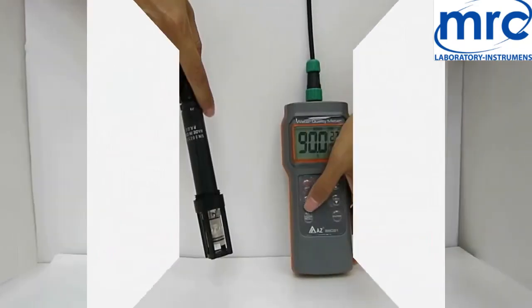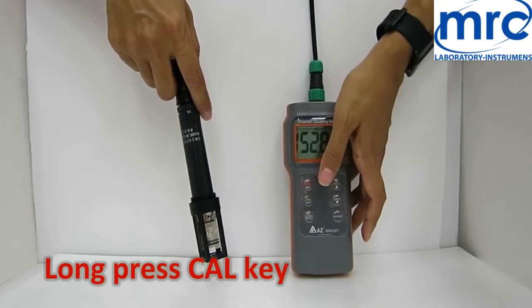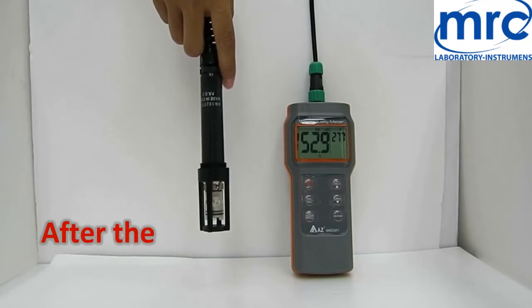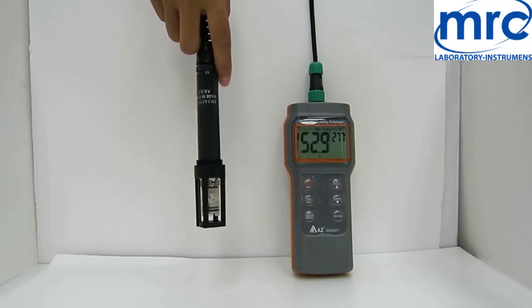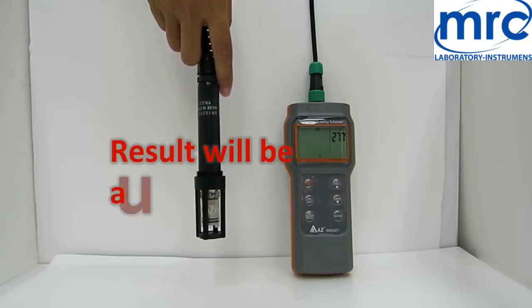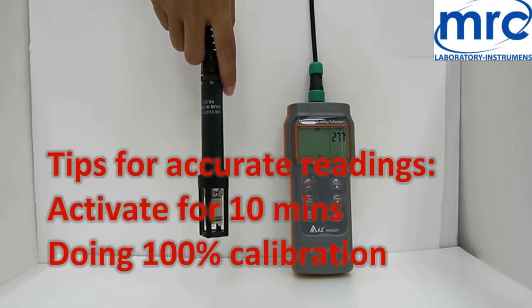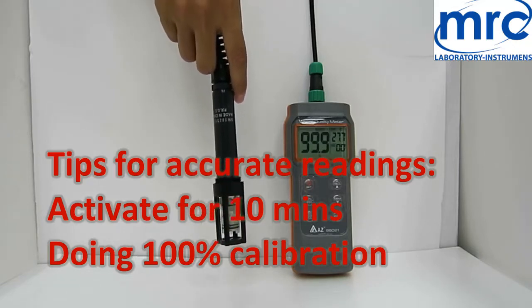Hold the DO probe in the air. Long press Cal until the Cal icon appears. After the reading is stabilized, press Enter, or wait about 30 seconds. SA appears when the result is automatically saved and it will return to measuring mode. Remember to turn on and activate the electrode for 10 minutes and perform a 100% calibration to get accurate readings.